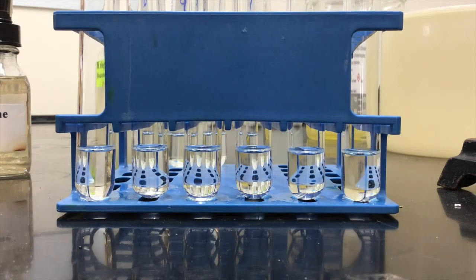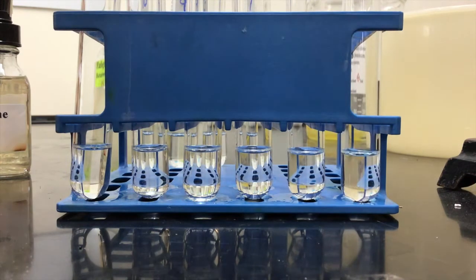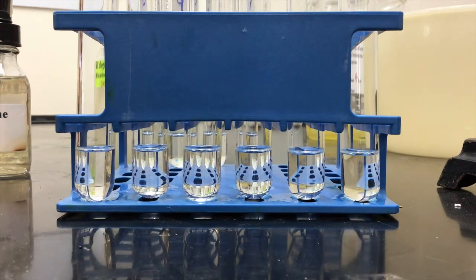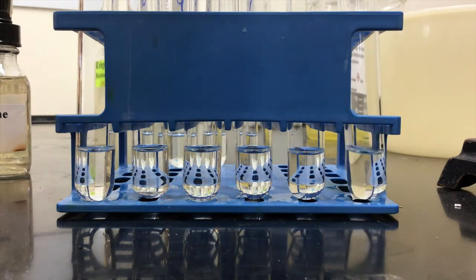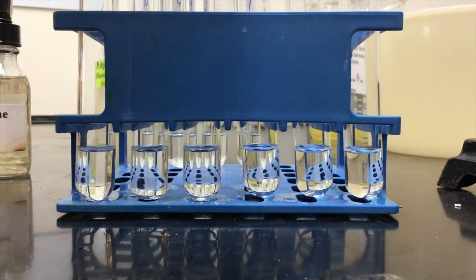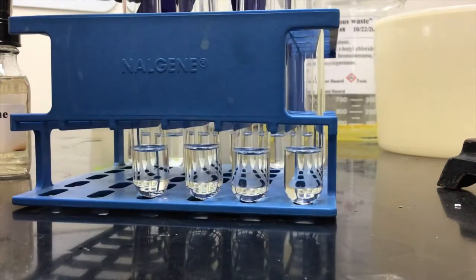So that's going to promote Sn1. I have number 1 right here, and then this is number 6. And when it comes time, I'll put the ones that are in the back, 7, 8, 9, 10. We'll rotate this rack so that you have a better look at them. But what I really want to do is quickly add the substrates to all of these and then let you take a look at them for a bit. And then we'll rotate this around, like that, and then we'll move on.